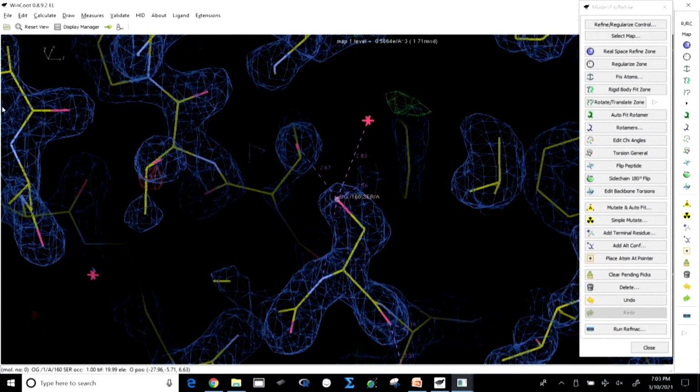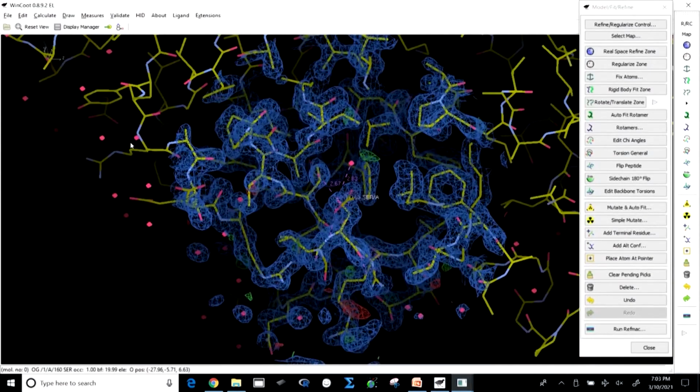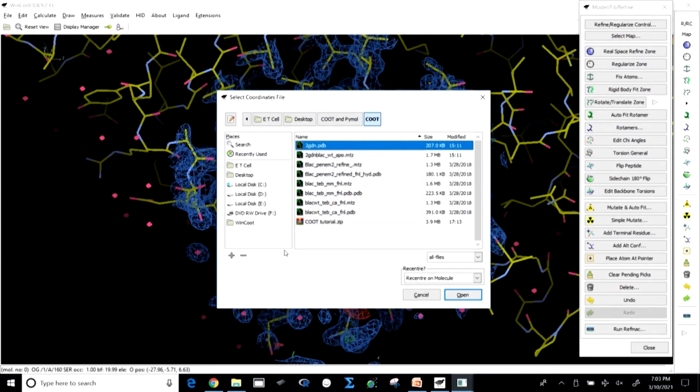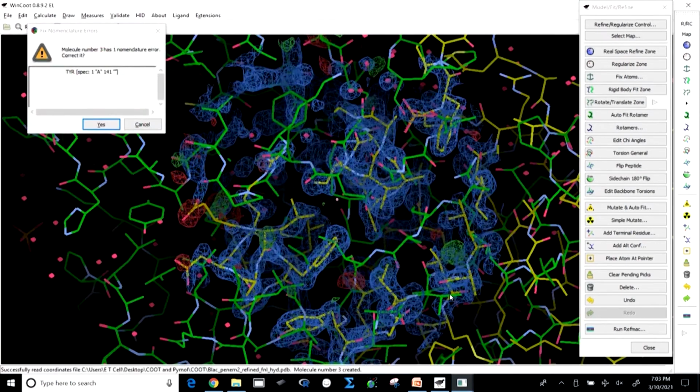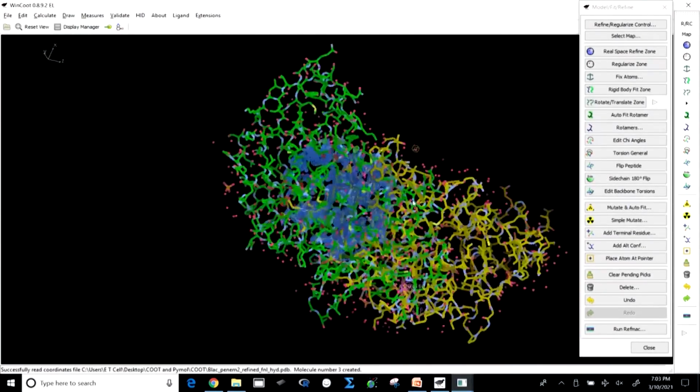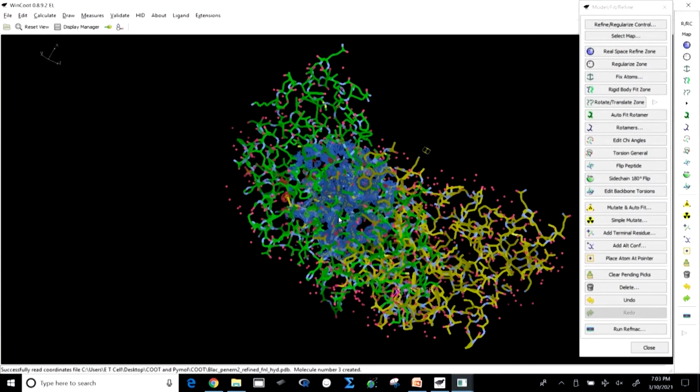So, what next? Let us go to one other structure. So, load the coordinates of the PNM structure. PNM structure is there. Now, if you remember, all the 4 structures come from the same protein. So, they have the same amino acids. So, you could compare them.